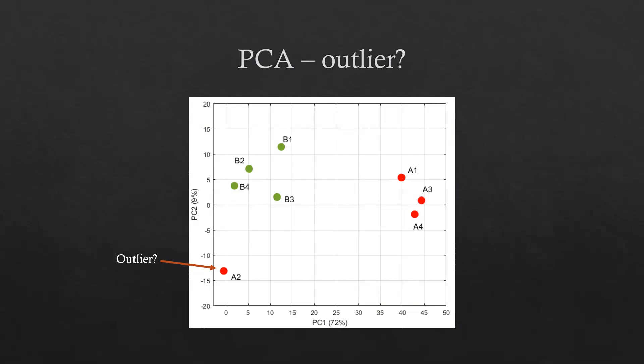Except the other sample, A2. A2 looks far away from both group A and B. It reminds us of an outlier, probably, but we are not sure.